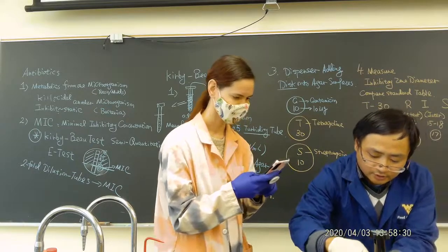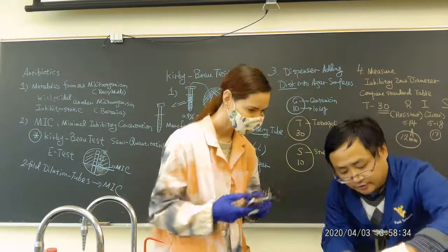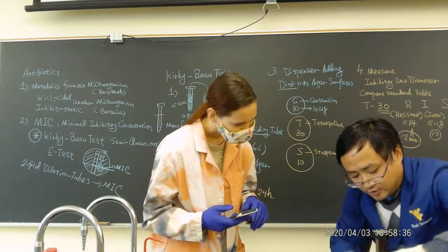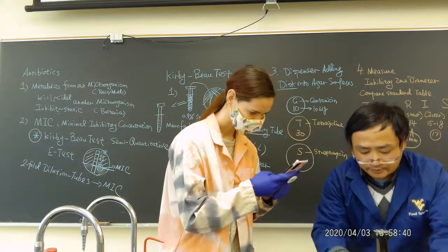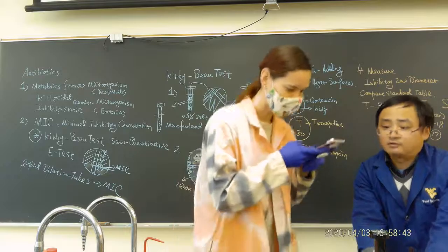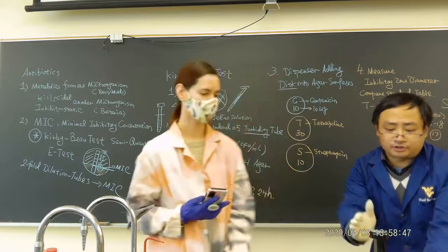This actually should go down. I don't think this one works very well. So, okay. Then another one I usually put on the side. So you can take a picture right now for this one. We added 3 antibiotics tube into a dispenser.